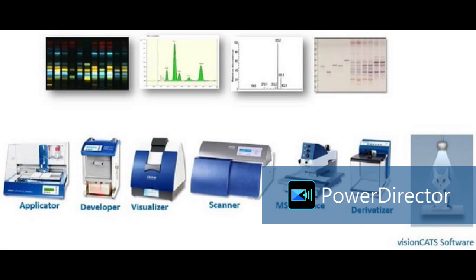Create a folder in which the files of the analysis are to be stored. Click on the New button to start analysis, using a Camag system. These are the tutorial videos we have prepared, already posted. Ma'am, the site is Anchrom on YouTube. Just type ANCHROM on YouTube. You'll get it.